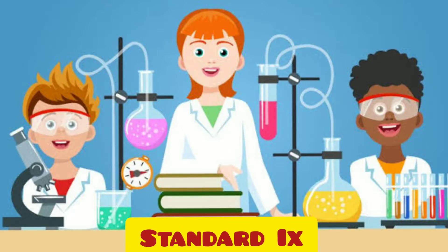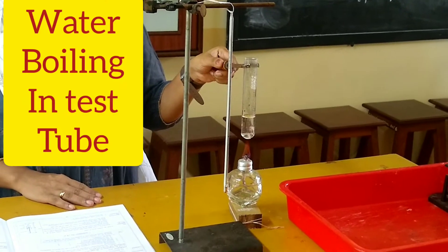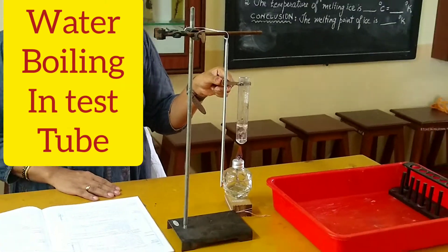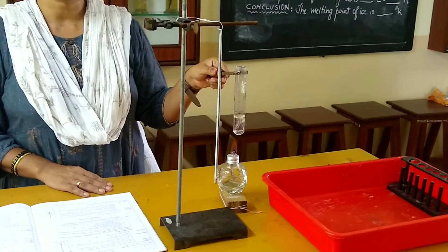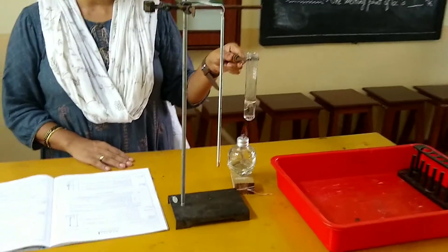Hi students, today we are doing the second experiment, experiment number 1B1, and the aim is to find the boiling point of water. Here you can see the test tube and the water has already started boiling. We need to check the temperature using the laboratory thermometer.